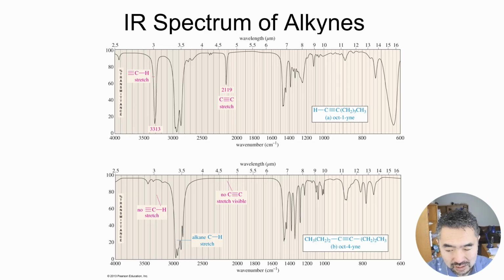Now this is usually smaller than what this textbook spectrum shows you. Again, we have the sp3 CH because there's the sp3 part of the molecule, and then the triple bond stretch appears around 2,100 to 2,200 wave numbers. Often this can also be pretty small, just so you know.